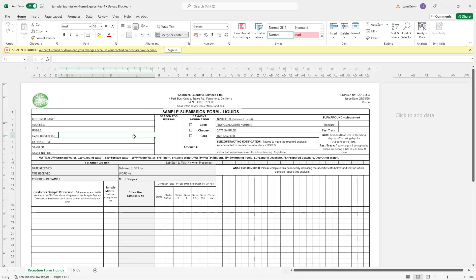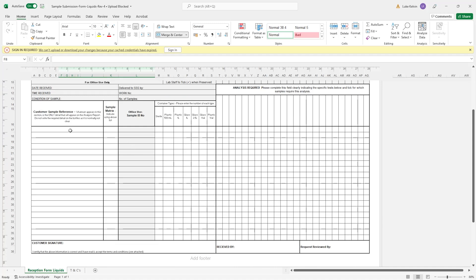You can also request to have your results sent to you via post. Mark the date and time sampled, the sampling point, example kitchen sink, a sample reference of your choosing. The sample matrix is DW and the required analysis as chemistry and microbiology test.